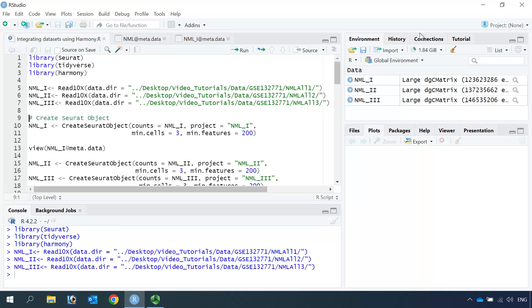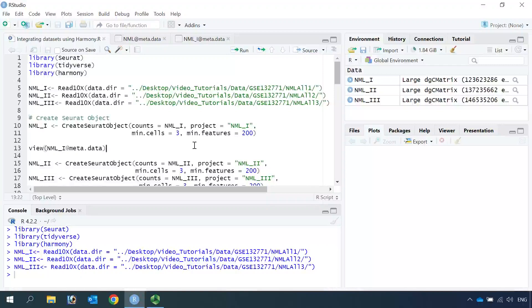So let's read the data into R. You can see in our data window we have three large DGC matrix datasets named NML1, NML02, and NML03. Now we can create Seurat objects for the three datasets, keeping genes that have expression in at least three cells, and cells that have at least 200 gene expressions.